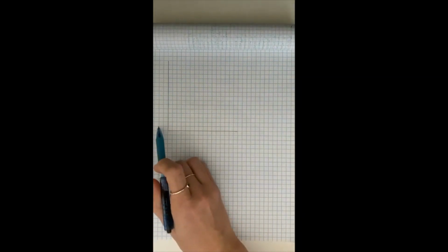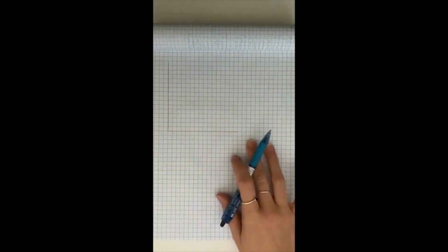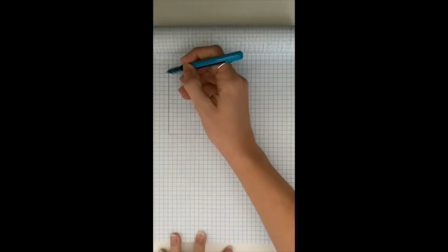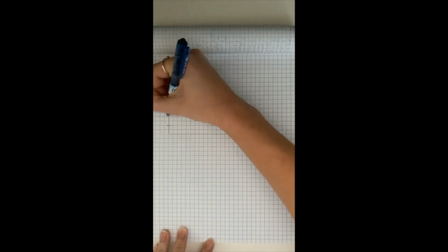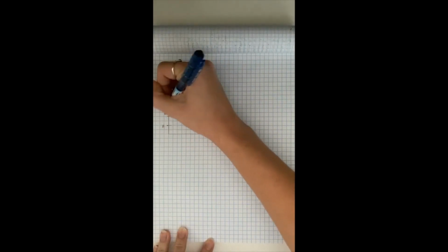If you want, remember to leave space over here and space down here. You can do your data table and then graph, or do it on as many pages as you need. Just don't make it cramped. That's the big thing. The next thing we need to do is leave room for the actual graduation tick marks. So you would go through and see how much space you need, and then draw those in and put your actual numbers.